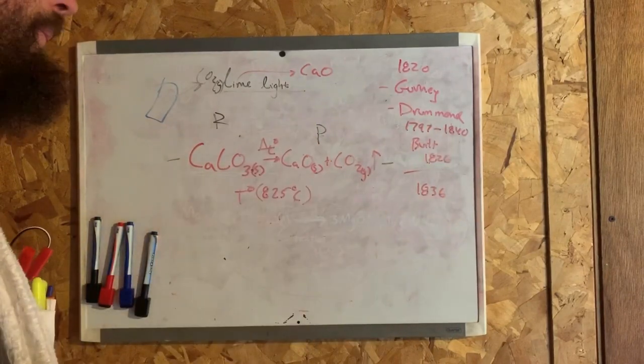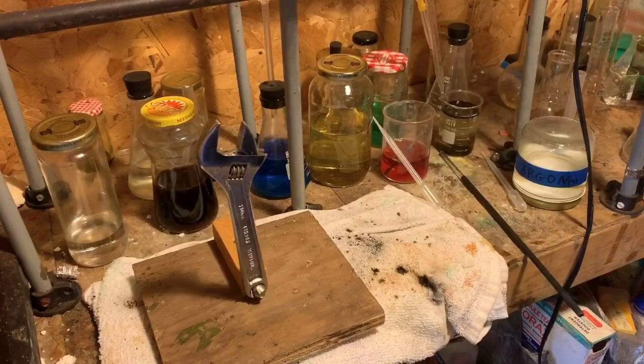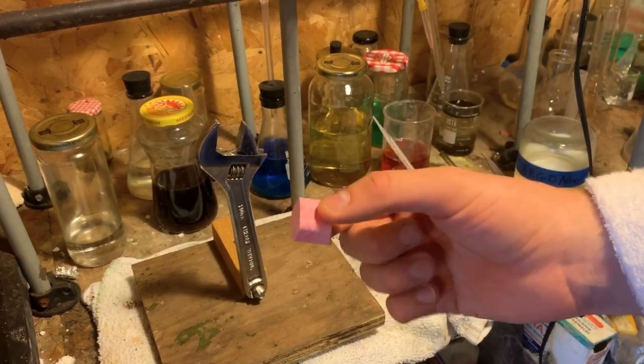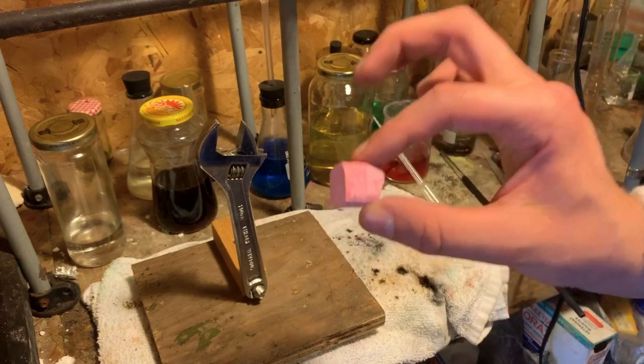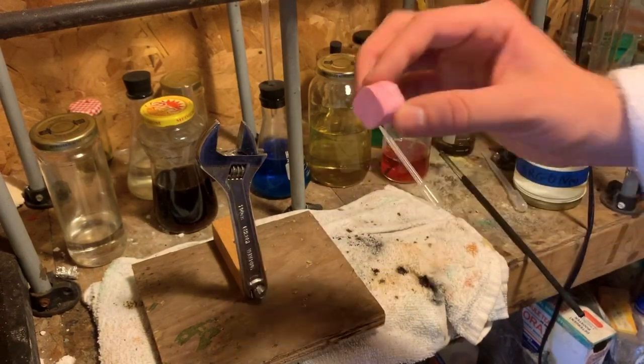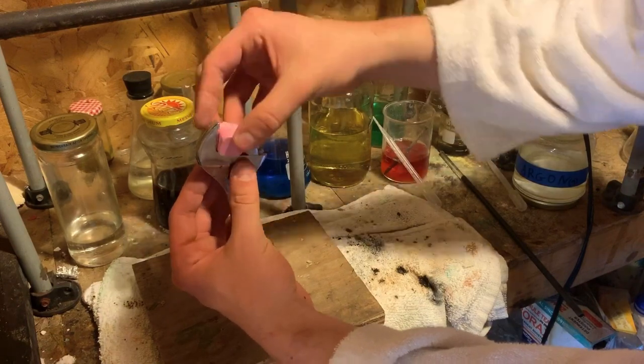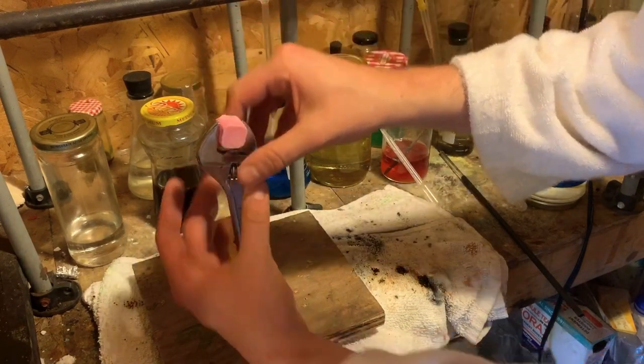Let's head to the laboratory and let me demonstrate this effect. As a visual, I'm going to use colored chalk. This chalk is the calcium carbonate, CaCO3 in solid form. To convert this piece of chalk into lime, which is the calcium oxide, I'm going to heat it.